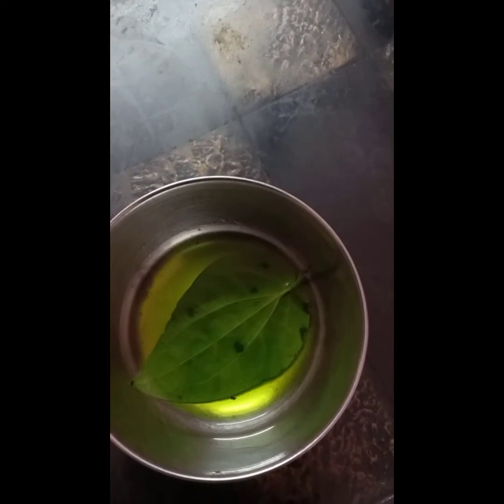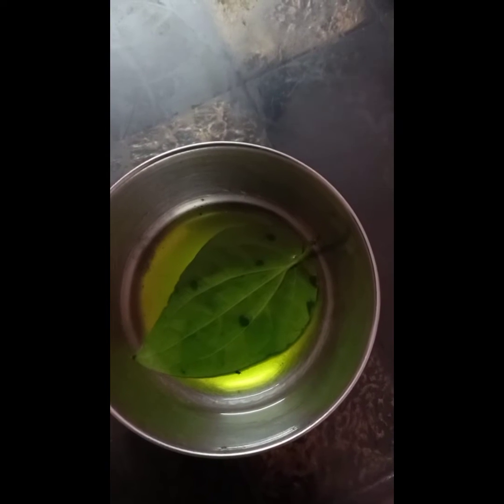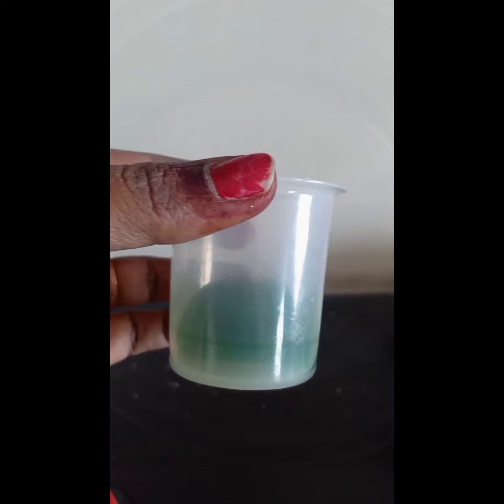Now this leaf is boiled for 5 minutes in water. See, the leaf is boiled in a container for 5 minutes. This is the chlorophyll pigment extracted.